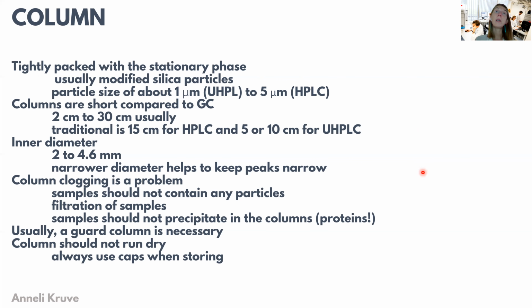And these particles are usually silica particles that are either pure silica or for which the surface of the silica particles has been modified chemically so that we have different properties of the stationary phase.